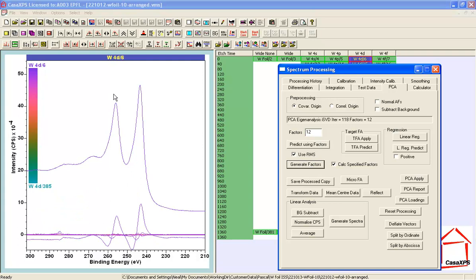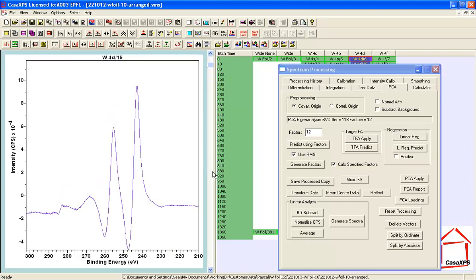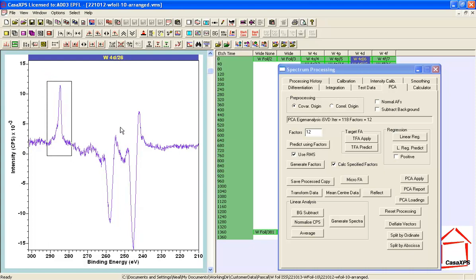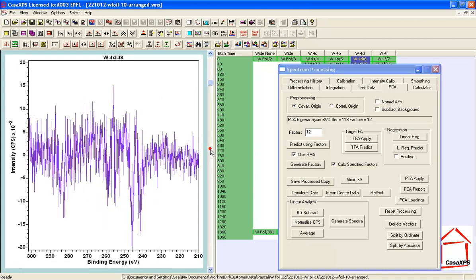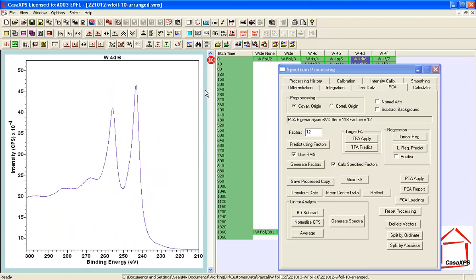When I press the Generate Factors button, the abstract factors appear as process data. If I list these on the left-hand side, I can investigate which look like spectroscopic shapes or derivatives of spectroscopic shapes. The first one certainly looks like a spectroscopic shape. The second looks like a differential of a spectrum — perhaps a shift. Then we have another with peaks; this one looks very much like a carbon peak with some negative-going structures associated with Tungsten 4D. The fourth again has carbon and more shapes. Eventually I start to see abstract factors that look like noise.